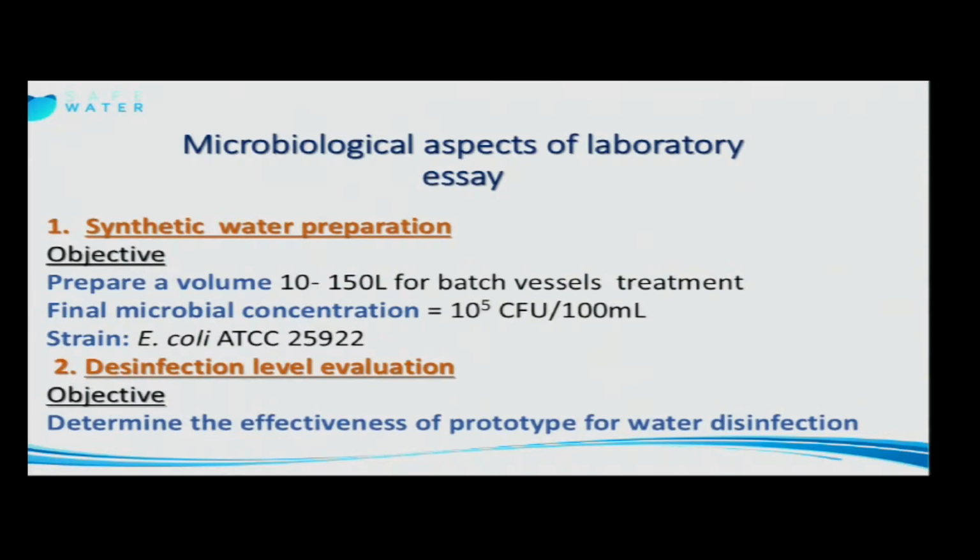Then for the microbiological team that is working on the project, we have two principal objectives. First is the synthetic water preparation, and the other is the evaluation of the disinfection level. In the first topic, to prepare the water, we have the challenge of preparing different amounts of water depending on the prototype that we are evaluating, with that amount of microorganisms, specifically the E. coli, the strain that we have in the lab.